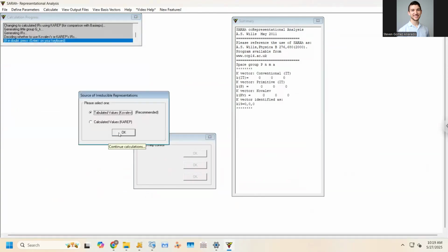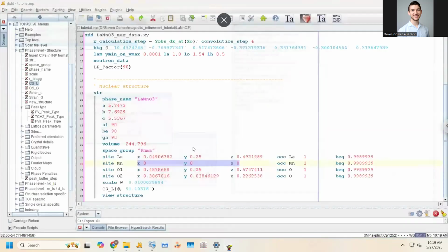This is going to take a long time, so I'm not going to run it. Hopefully it didn't overwrite the file that I already gave it. But basically, you hit this, and then it'll sit there for maybe 5 minutes and spit out some files. So I'm going to close this, and hopefully it didn't overwrite the files that I already generated.